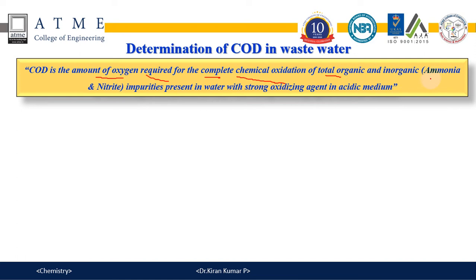The inorganic compounds such as ammonia and nitrites, using a strong oxidizing agent such as K2Cr2O7 in an acidic medium using sulfuric acid.